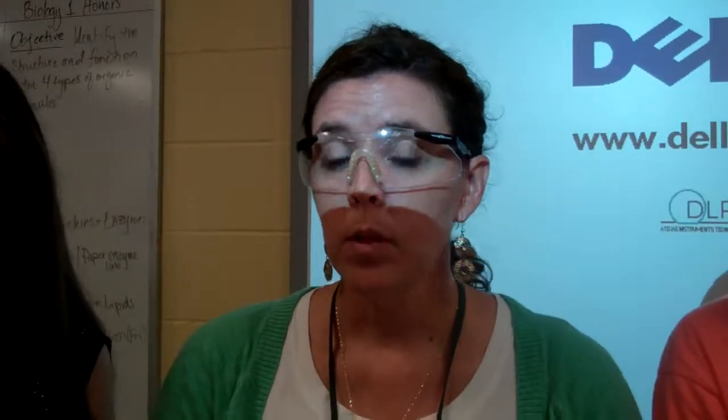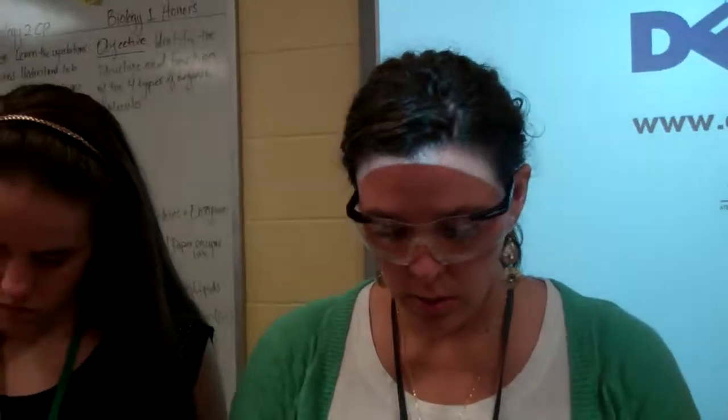Unless the acid is an inhibitor, it really shouldn't slow it down. So what if the acid is an inhibitor? I mean, the change in pH could slow it down. Okay, so she said the change in pH could slow it down.